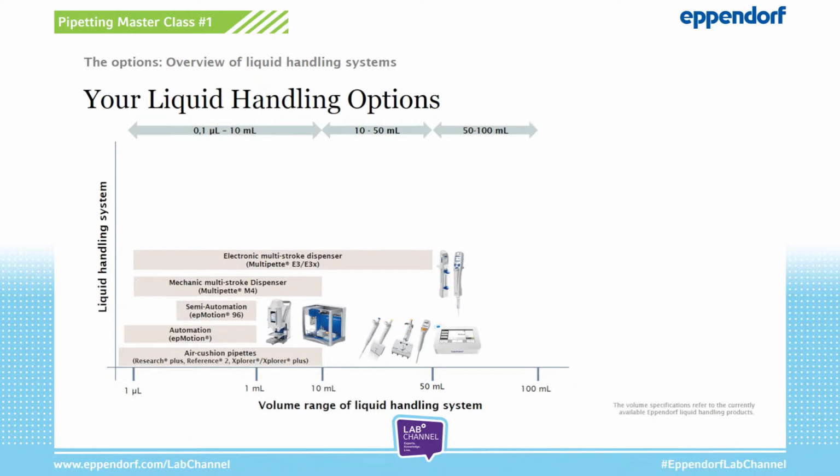And the positive displacement pipette is more or less the underdog, I would say, among liquid handling tools. It is a pipette, meaning a device for one-time dispensing of a certain volume, but it works based on the positive displacement principle and is therefore also suitable for difficult liquids with other physical properties than water, because, as you remember, no air cushion, no problem.